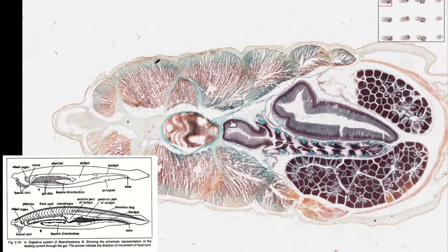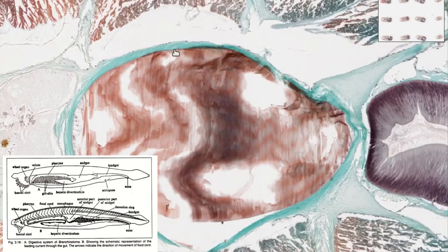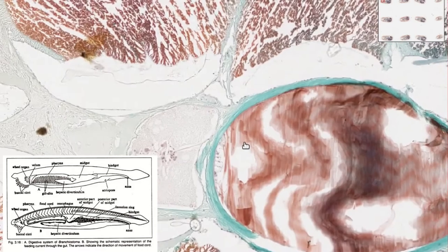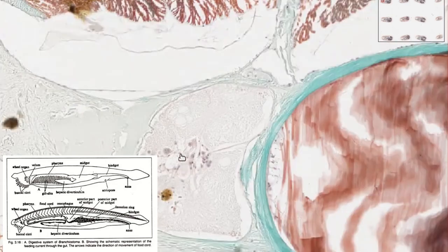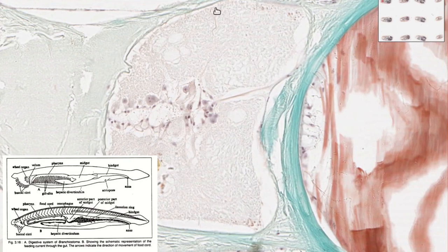Perhaps this is the start of the esophagus here. And we have a much nicer section of the notochord. So if we zoom in, this is the notochord. And then just above the notochord, we've got this rather faint structure here.